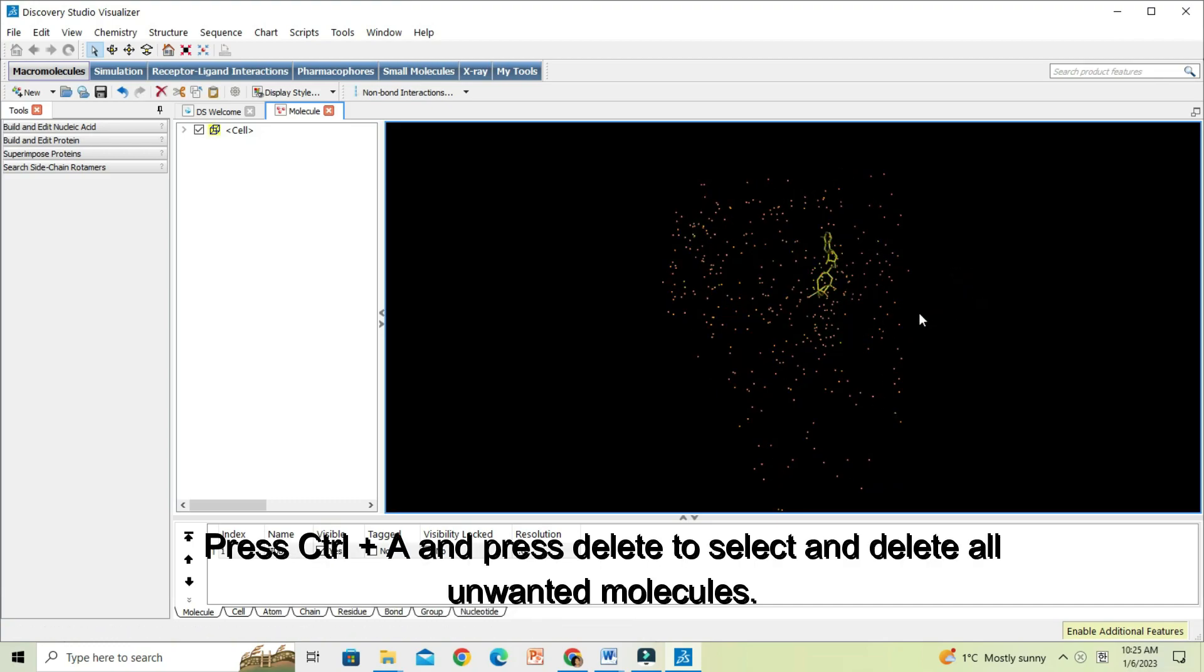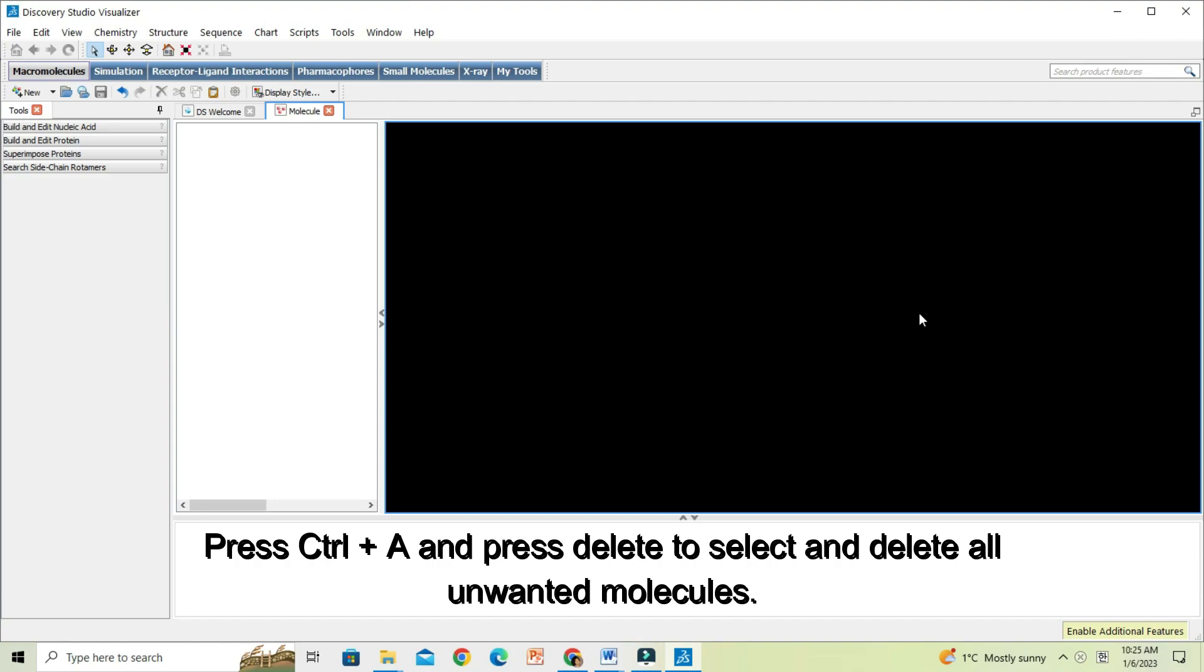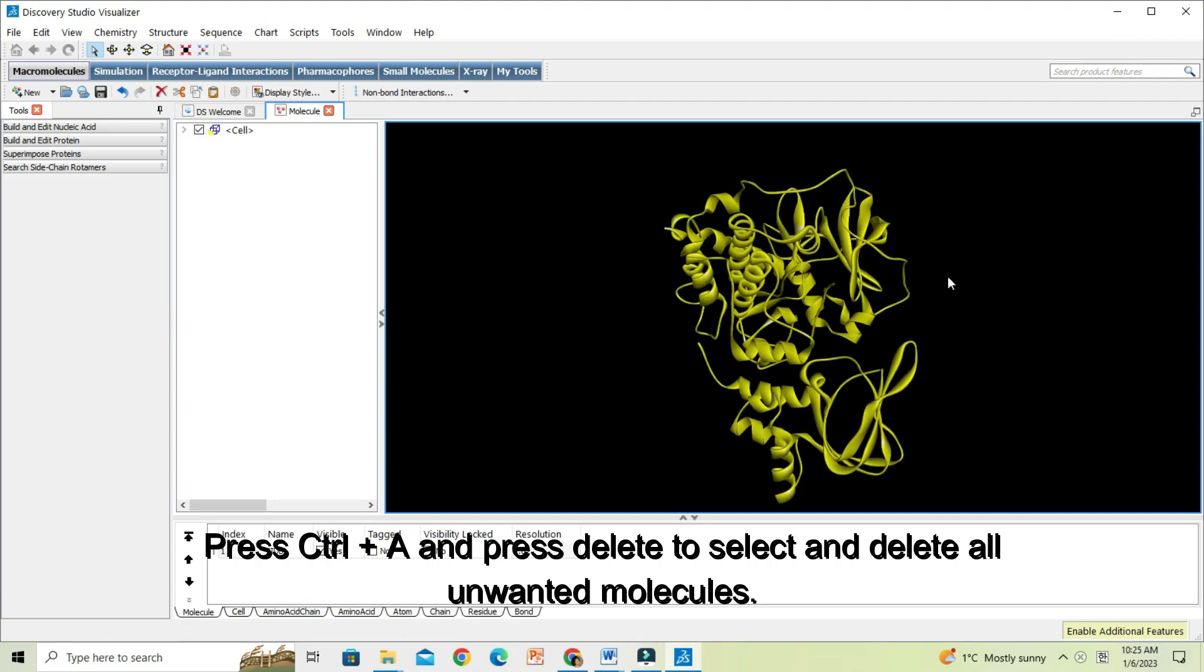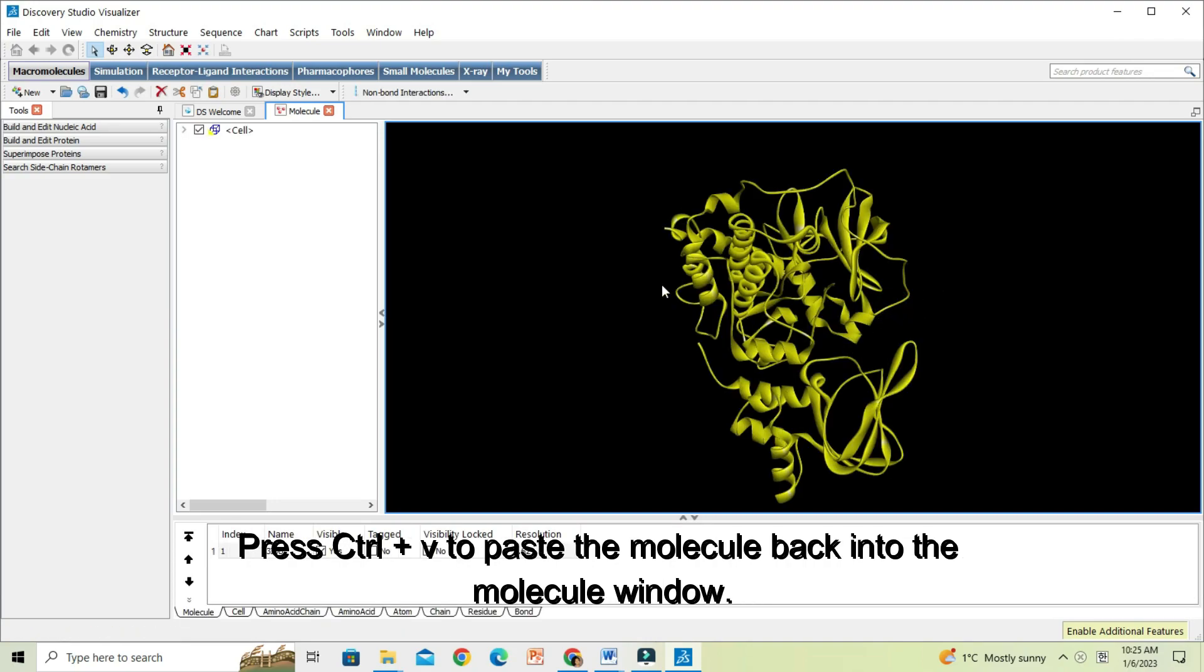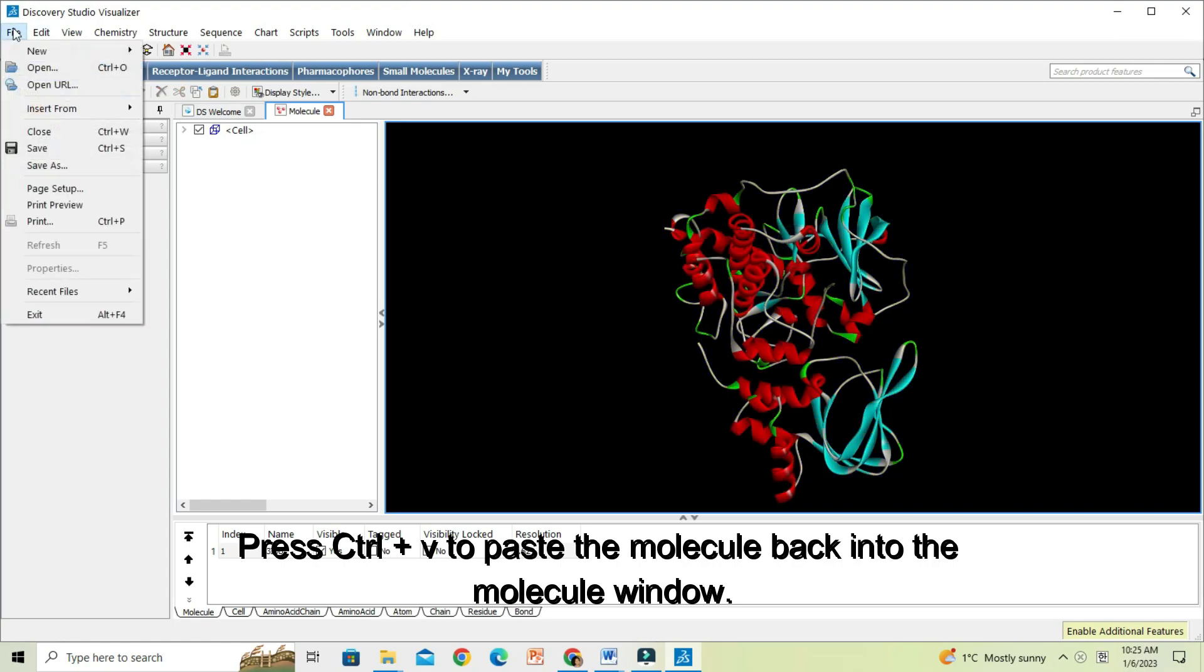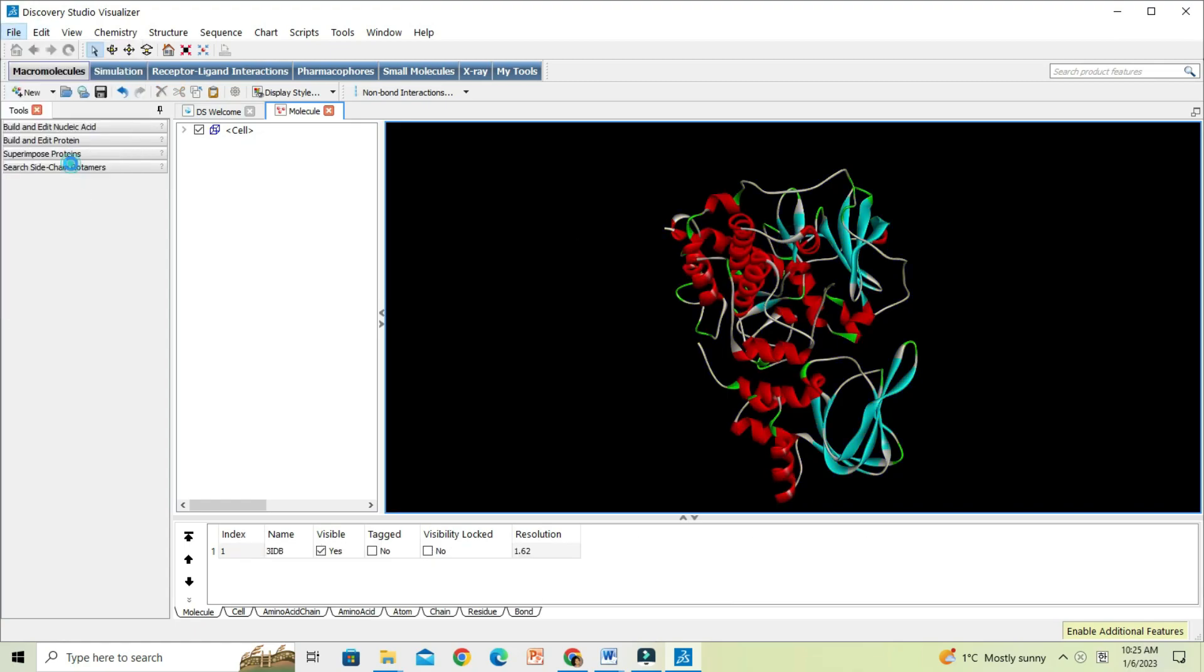Press Ctrl A to select all the other molecules and atoms, and now press Delete. Now press Ctrl V to paste the protein molecule alone into the molecule window.